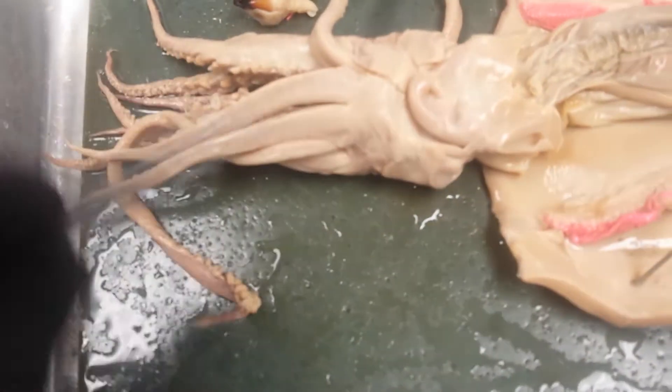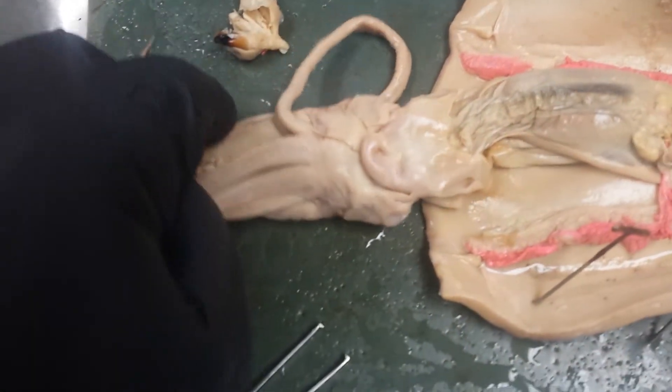On the side we have an eye. And then we can find, if we look over here, a very beaky-looking beak.